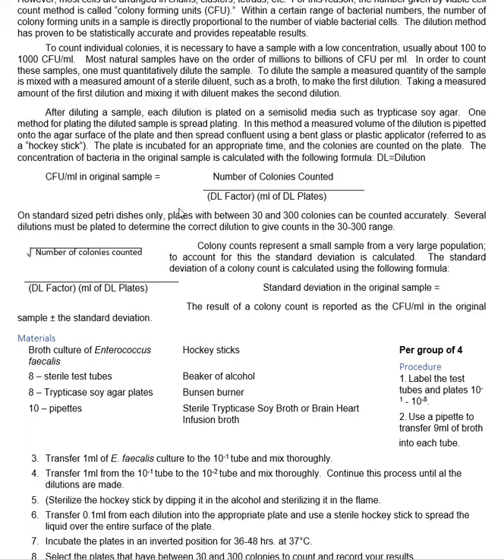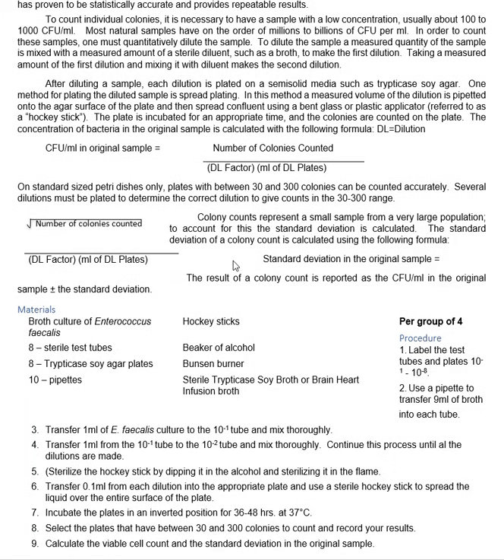I get around 1,000 colony forming units per milliliter when I did the math. But in any case, of course we have to do, let's see, I said 100, the square root of that's going to be 10, and that's plus or minus about 1/10 of that, plus or minus 100. In any case, that's the way that it's done.